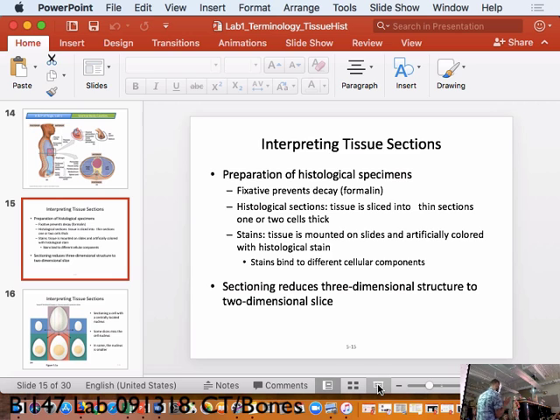The way this works, these slides, some of them are very old, and that's okay because old slides tend to be done better. They just don't make them like they used to. Back in the day, you could get these awesome slide preps, and nowadays, most of the new slides you buy are crap. So it's okay that they're old, but they are fragile and hard, if not impossible, to replace some of them very well. So please be careful. The way to be careful is just to follow my instructions on how to use a microscope.